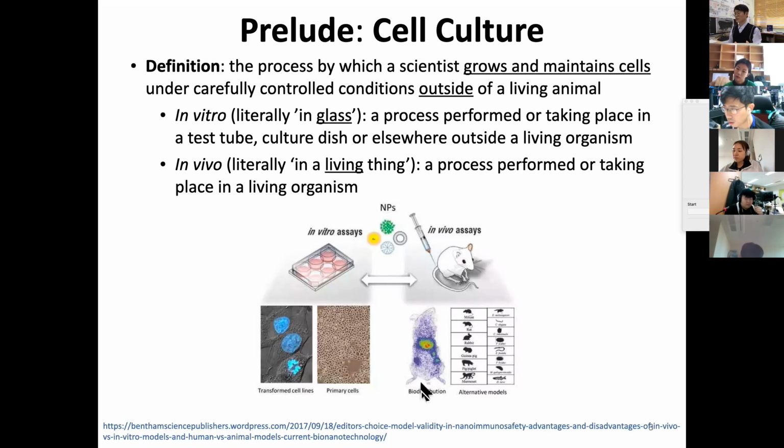So you can see in this case, this particular example is nanoparticles injected into the tail vein so that they distribute throughout the body. And we wonder how these nanoparticles or maybe treatments are distributed. So in this case, you can see obviously in the liver there's a lot of accumulation, and maybe sometimes other tumor sites.